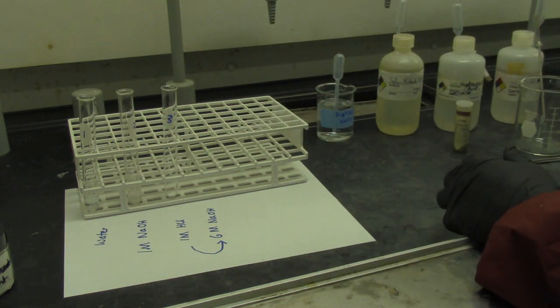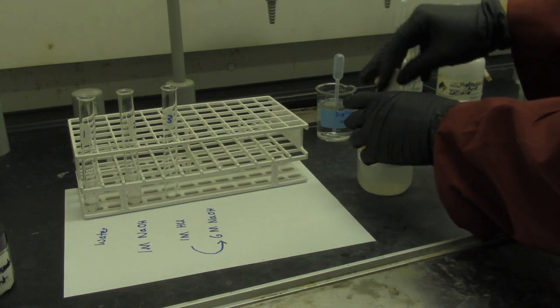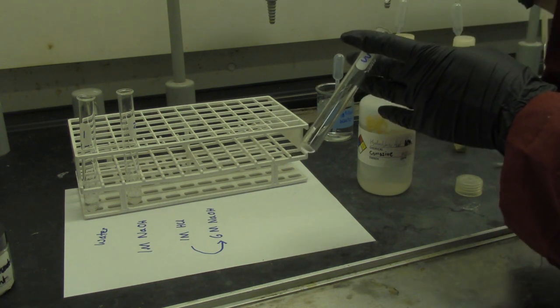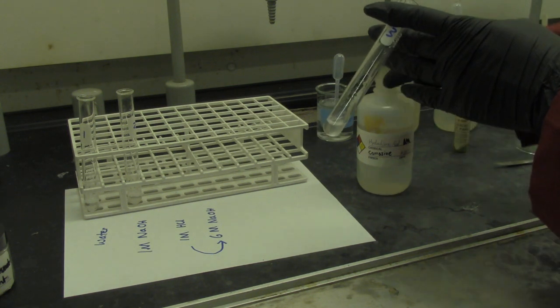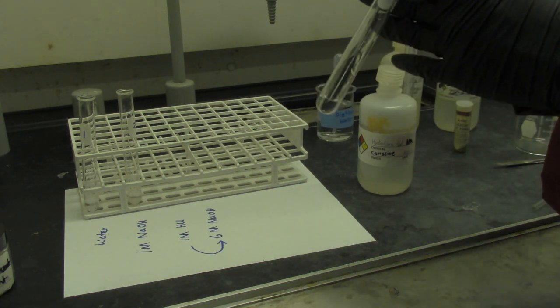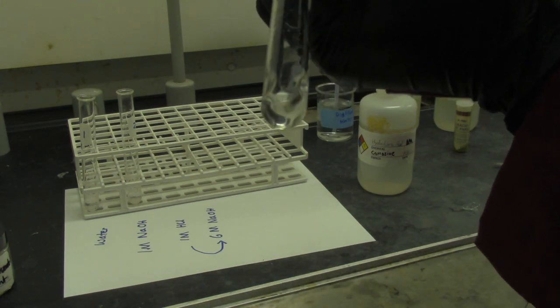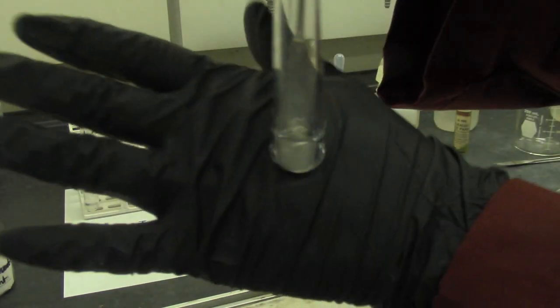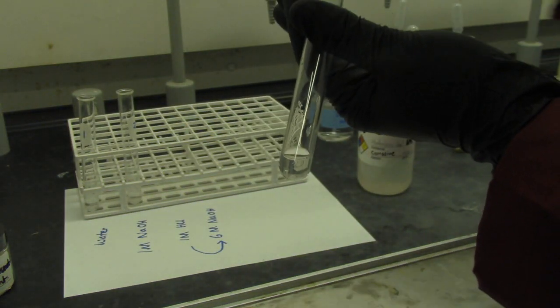So to the third test tube, we need 1 ml of 1 molar hydrochloric acid, and stir. Clear solution, yeah? Okay.